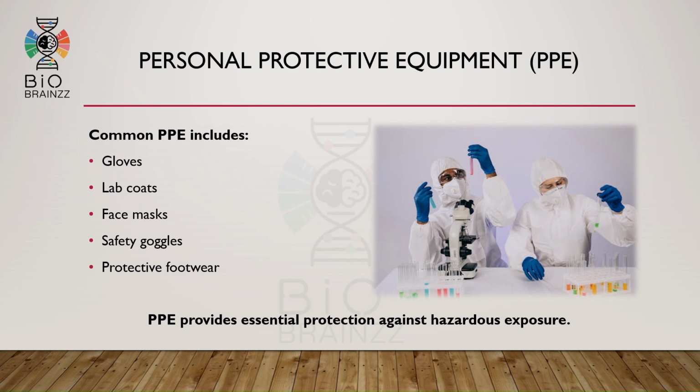Personal protective equipment or PPE provides essential protection against hazardous exposure in laboratories. Common PPE includes gloves, lab coats, face masks, safety goggles, and protective footwear. The selection of PPE depends on the type of laboratory work being performed.